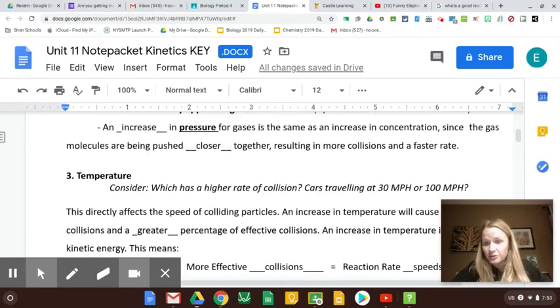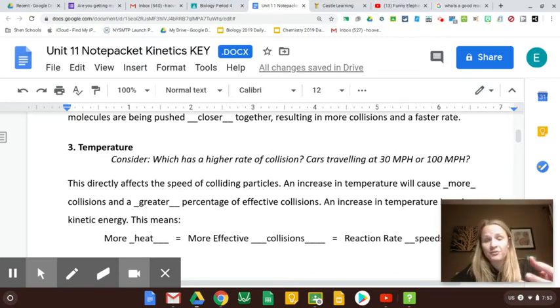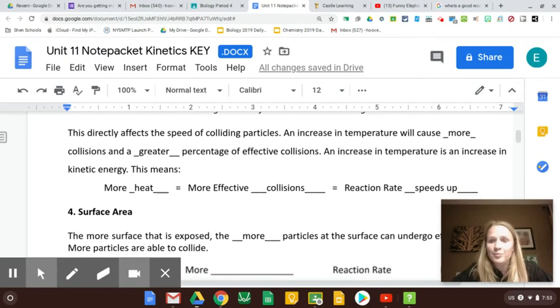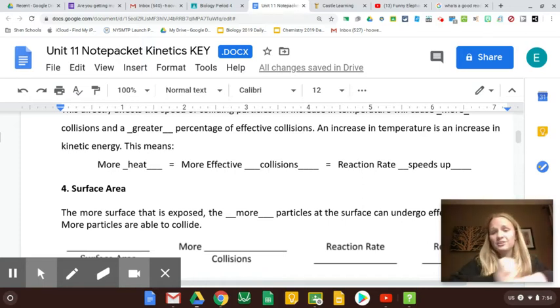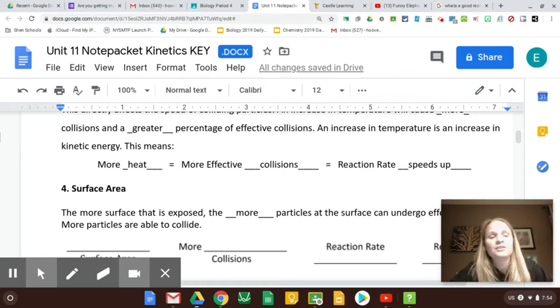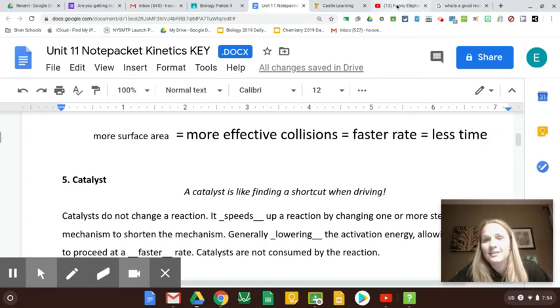We're going to use a super concentrated, really strong hydrogen peroxide. I like to heat it up — if you take hydrogen peroxide out of the fridge where we keep it, it doesn't work that great, but if you heat it up it works really nicely. I also like to increase surface area: I take the potassium iodide crystals, put them in a mortar and pestle, and grind them up so it's more like a powder instead of big chunks, giving better surface area. And we're using a nice potassium iodide catalyst.